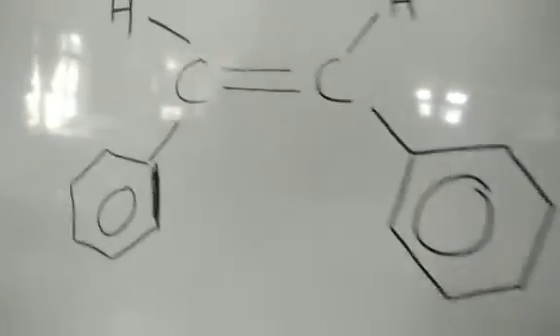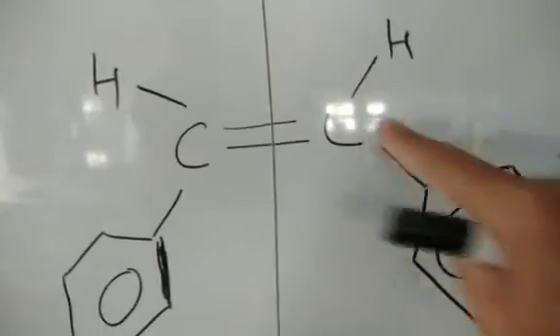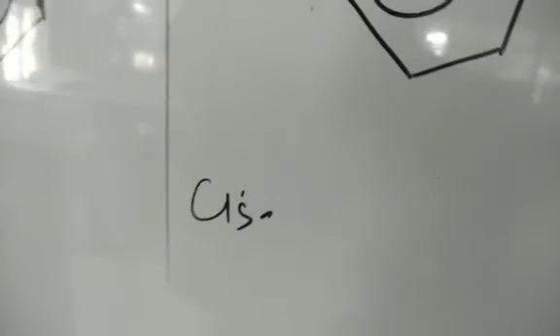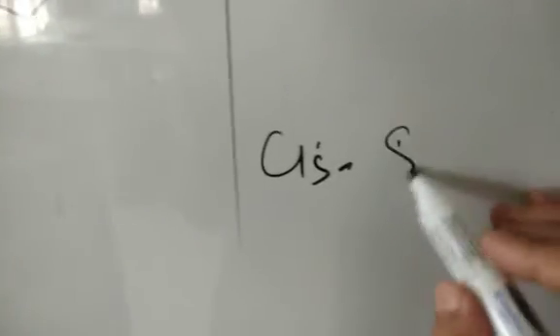This is a molecule called stilbene. It's called cis-stilbene. You can cut this into two halves, okay? So this is one type of proton and this is another type of proton. You got two signals here. So cis-stilbene, very important. It often comes in entrance exams, lectureship exams or the NET exams, sometimes related derivatives. Take the cis compound of this stilbene.